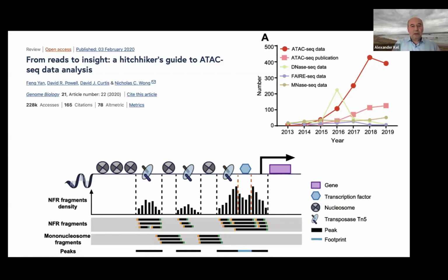That's a typical picture which you get from ATAC-seq, and that's a picture from this paper, which accumulates more or less the steps which you usually have.